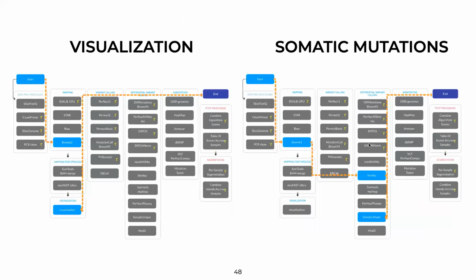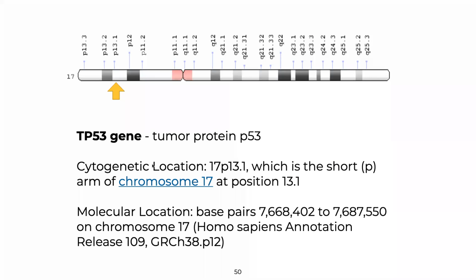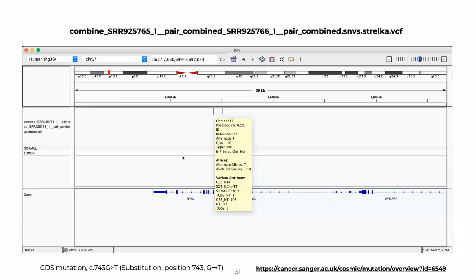and you can study those mutations looking here at the different types of analyses that we just did. You can see some of those examples, and in Genomics 1, you'll be able to open up the VCF file from Strelka that we just created and identify those mutations in P53 and learn how to categorize those mutations by annotating and understanding whether there is a known phenotype associated with those mutations.